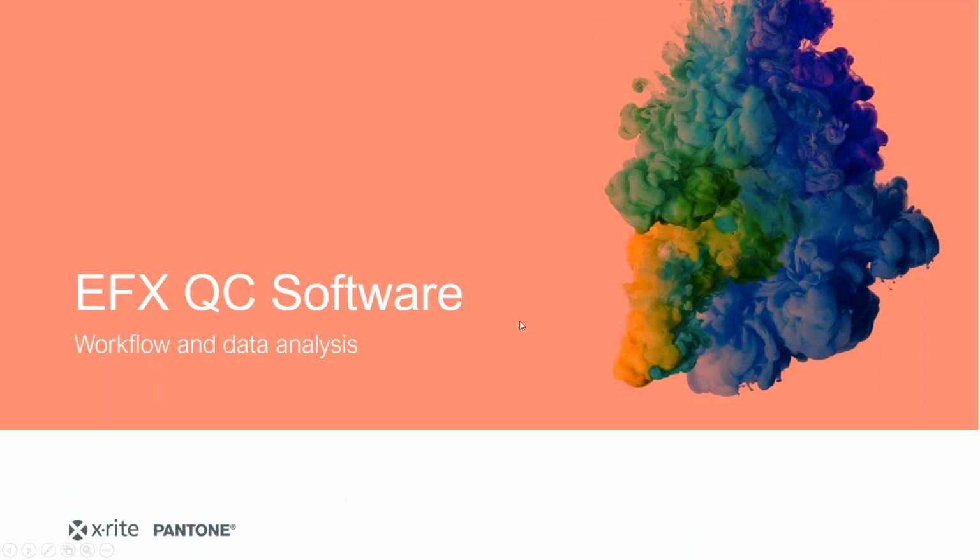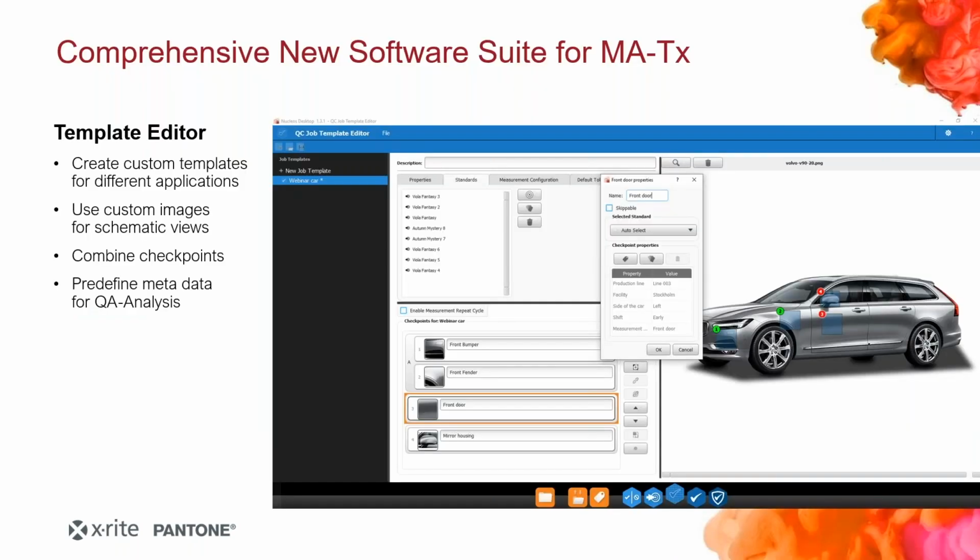In the EFX QC software, this is the software that we recommend for those instruments in order to analyze data. I set up a workflow that is just based on an automotive example that I made here. So you can create custom templates for each different application that you like to use.